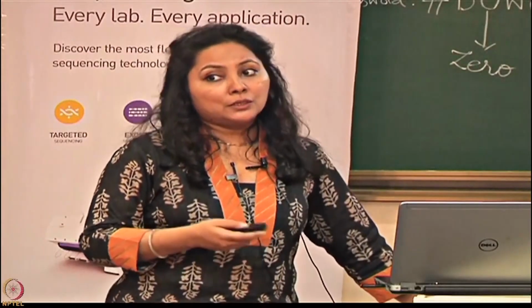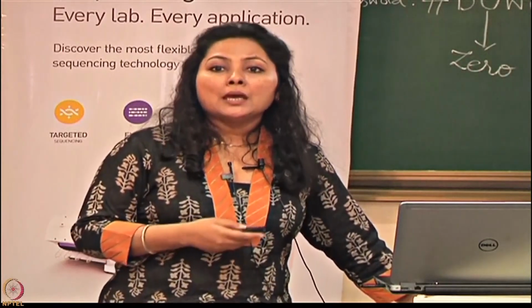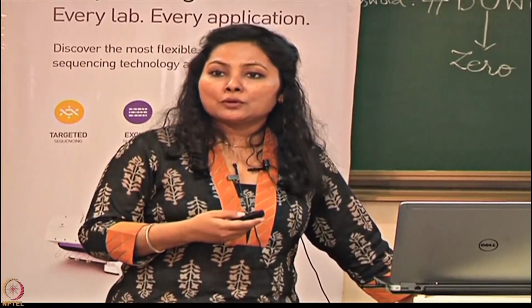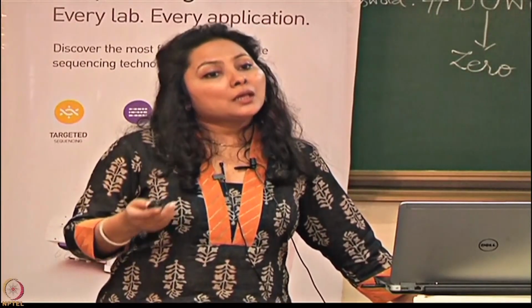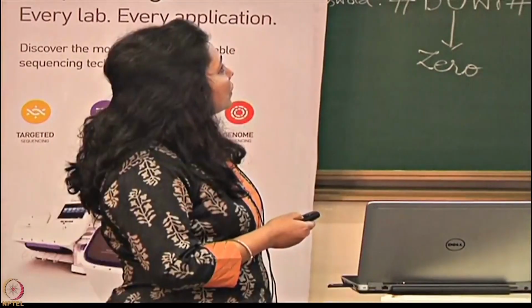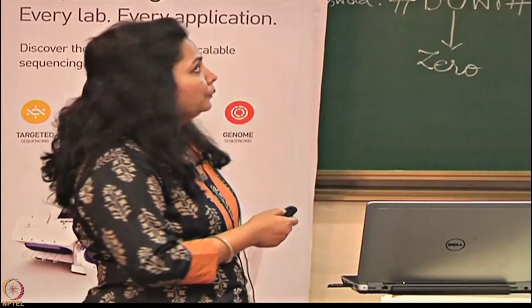So once you've loaded, you initialize your sequencer, which we discussed is going to take only 15 minutes, and then your sequencing run goes for anywhere from 2.5 to 4.5 hours depending on the kind of read length you are targeting.